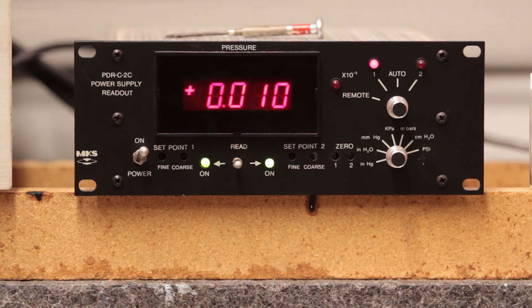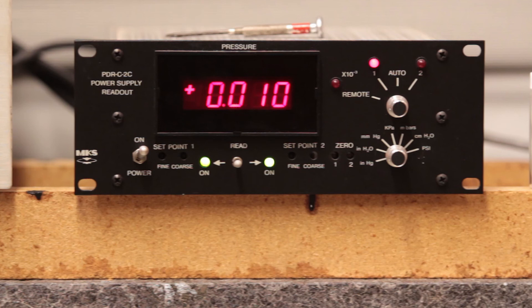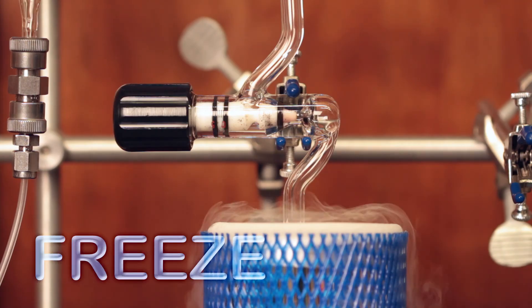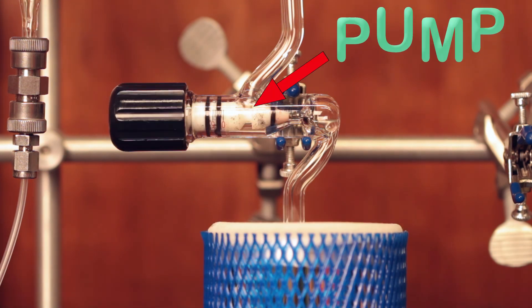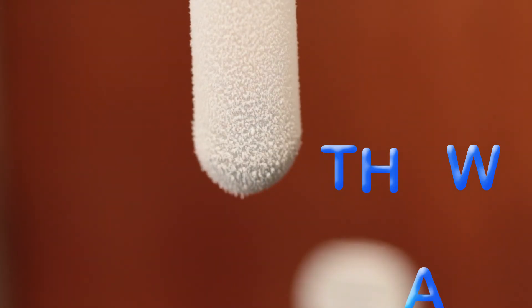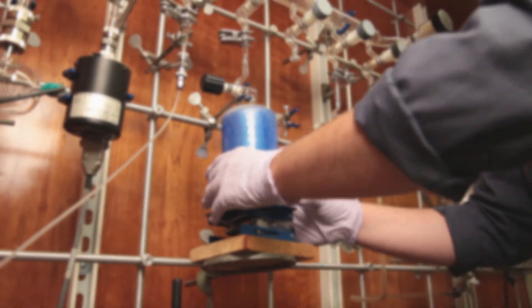Now that the pump is at its operational temperature, the pressure on the manifold should be less than 10 millitorr. The final step before filling our cell is to degas our iodine sample. To do this, we freeze our sample in liquid nitrogen, pump on the sample, and then thaw it. We repeat these steps multiple times. This is called freeze-pump-thaw cycling. We usually do this three times to make sure we remove any absorbed gas that might interfere with our measurements. In this case, we're mostly worried about oxygen, which can efficiently shut off emission pathways in our sample.